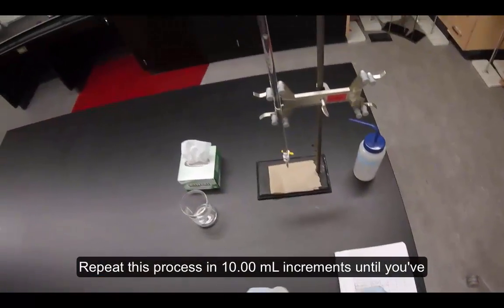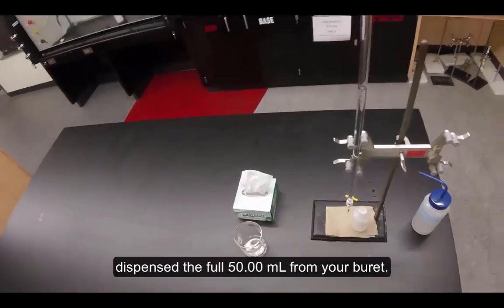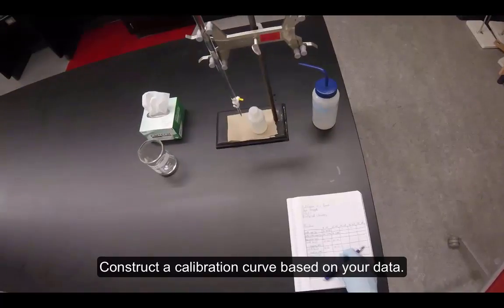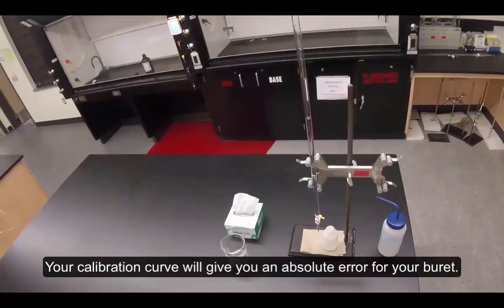Repeat this process in 10-milliliter increments until you've dispensed the full 50 milliliters from your burette. Construct a calibration curve based on your data. Your calibration curve will give you an absolute error for your burette.